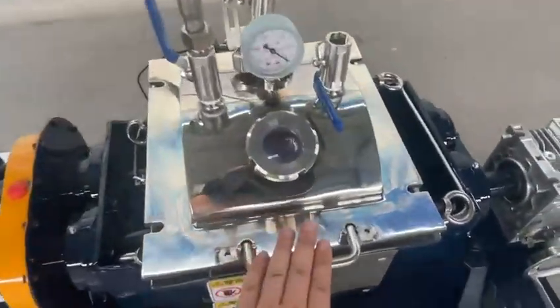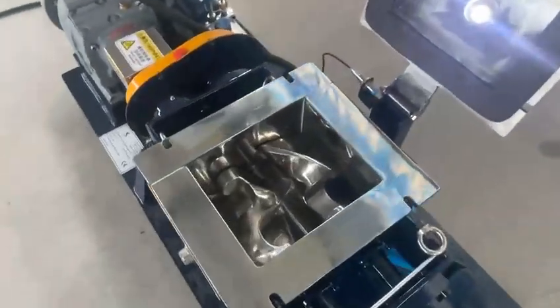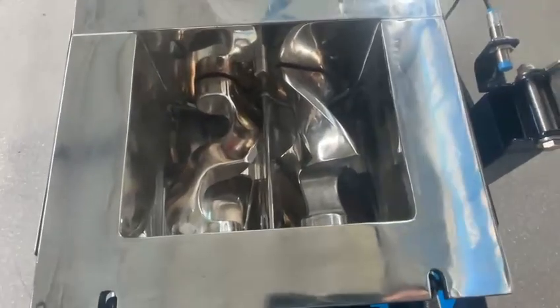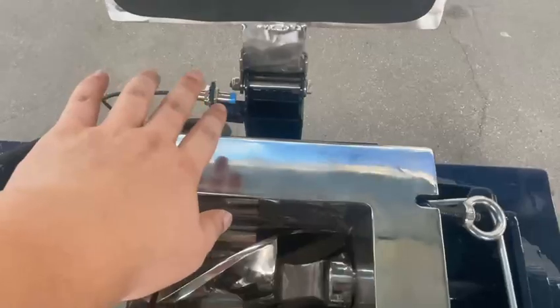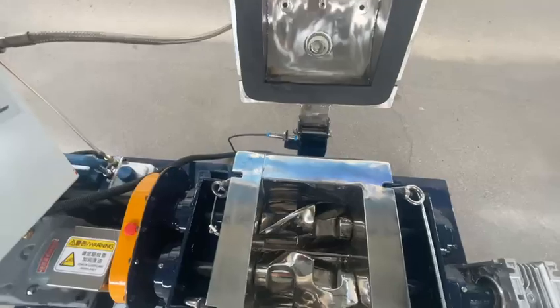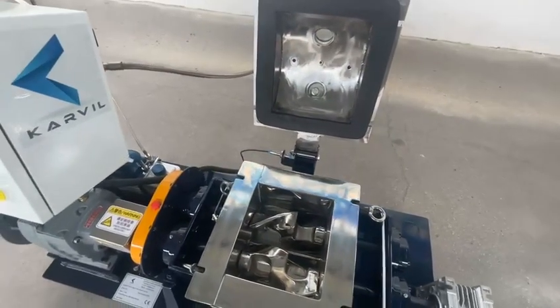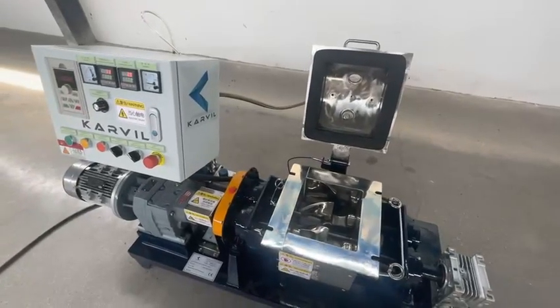Now I open the lid. We can see the double sigma blades have stopped mixing, because we have a safety sensor here. Once the lid is open, the mixer will stop for the safety of the worker.